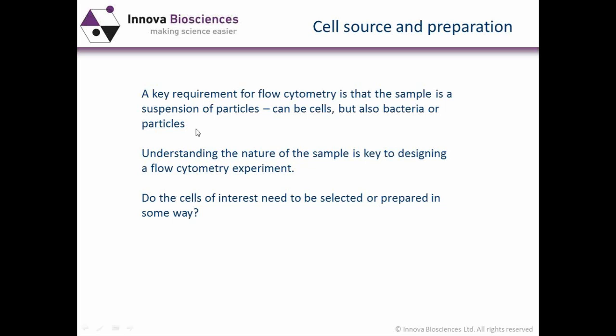Thank you very much, Claudina, and welcome everybody to this webinar. As Claudina outlined, I'm not really going to spend much time talking about the technical aspects of flow cytometers themselves today, or anything such as filter arrangements or the lasers. I'm going to be thinking more about the samples themselves and what you need to understand about preparing your samples for running on the flow cytometer.